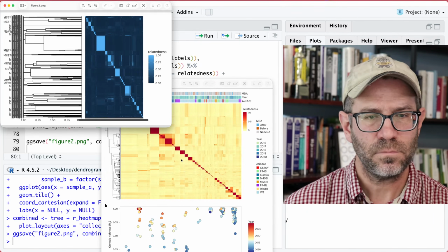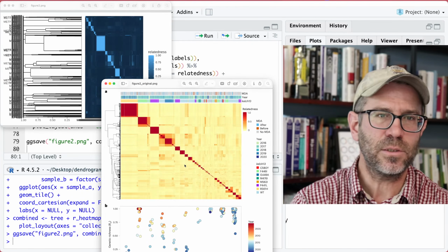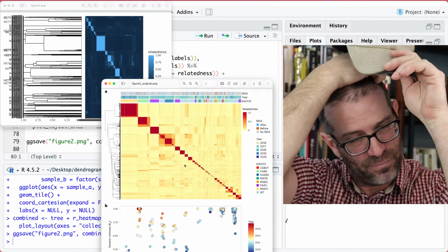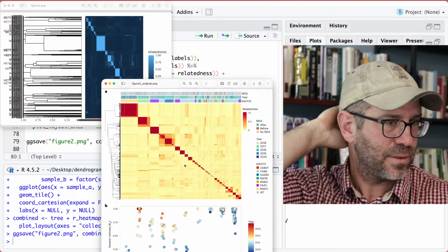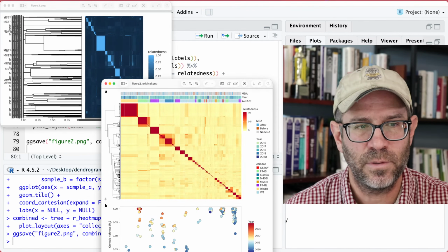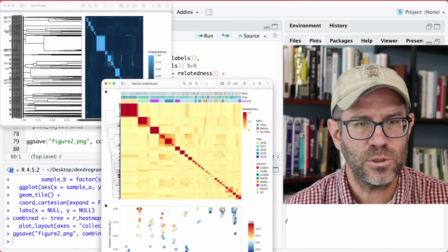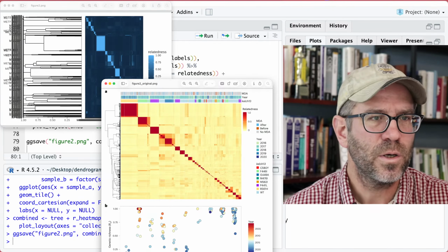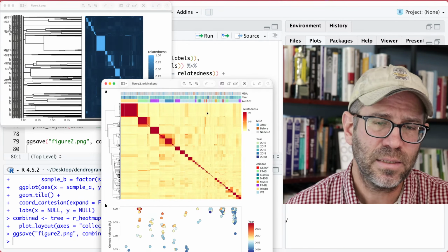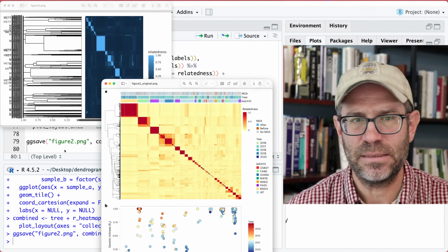Okay. Now, you might be looking at theirs and think, that looks a lot different than mine. I mean, yes, the color and the ordering of the clusters look different, but the tree looks very different, right? Like the branch lengths on theirs are larger at the top and smaller at the bottom, whereas pretty much all of my branches are long. And I have a suspicion that they did not do what they think they did, okay?